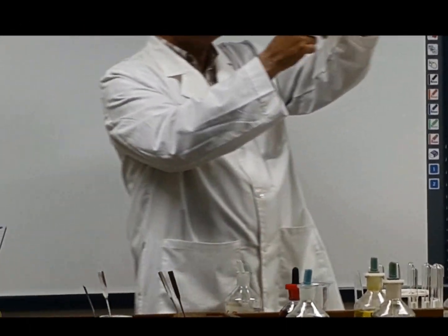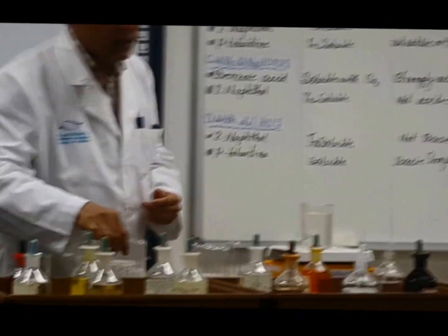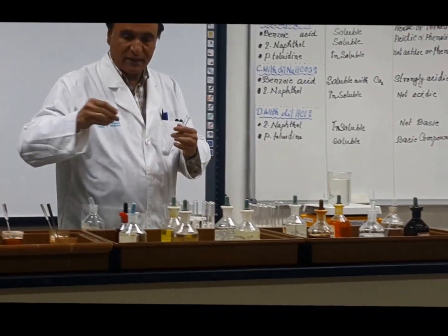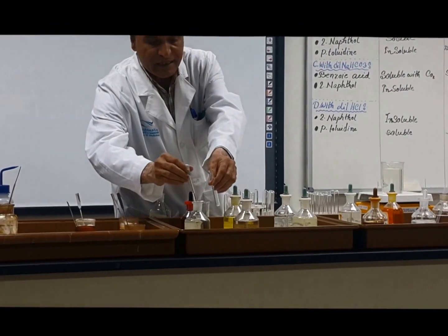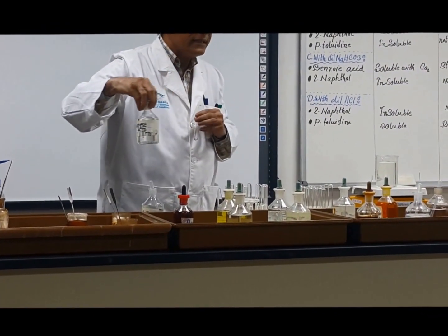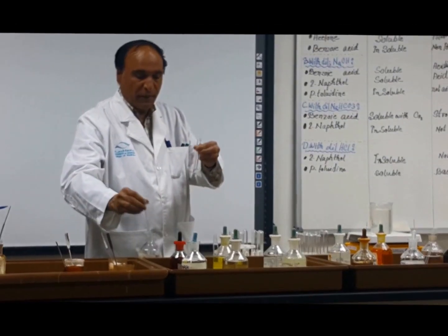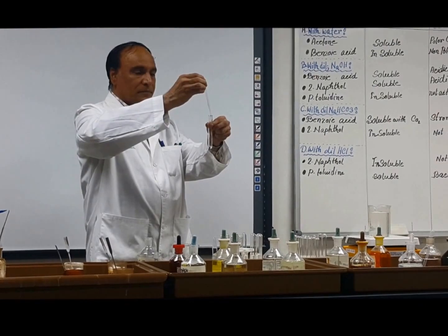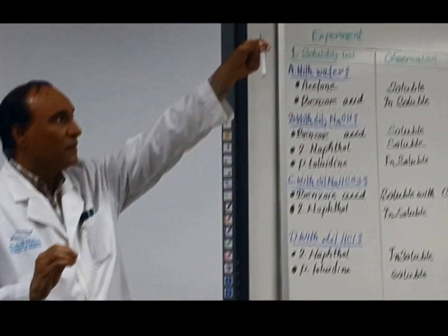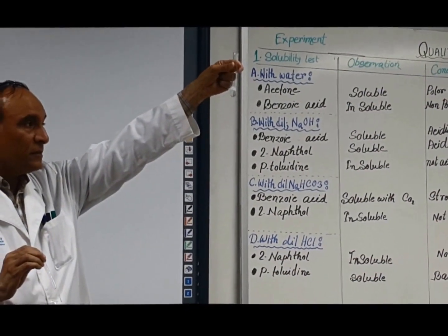I want to show you, it is not in the list, another acid which will give you more carbon dioxide. For example, acetic acid. You know acetic acid? Ethanoic acid? Organic acid? So look over here, if I put sodium hydrogen carbonate, see this one. What's this? Bubbles, carbon dioxide. It means it's an acid.